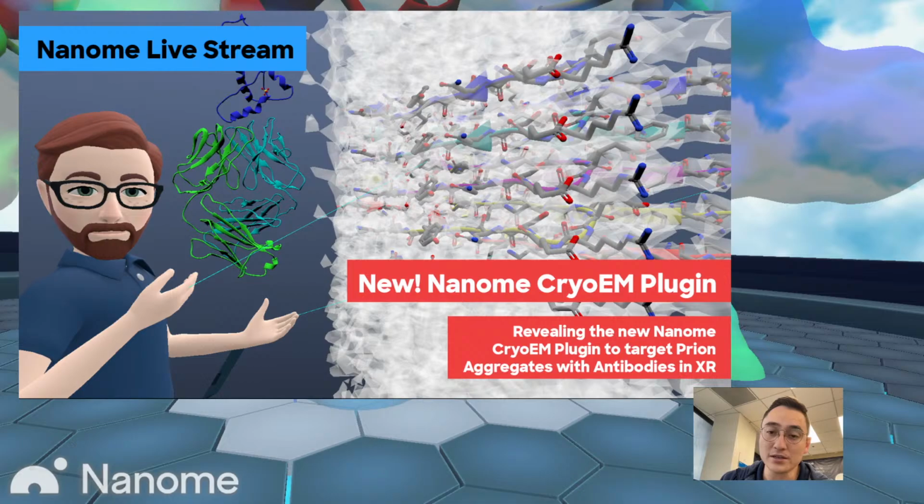Additionally, the plugin offers a range of customization options, such as adjusting color schemes and opacity of maps and using a viewport editor to show only certain portions of the map. We can't wait to showcase these features and demonstrate how they can benefit your research and analysis. So join us today to learn more about this game-changing tool and how it can revolutionize your work in the field of structural biology and drug discovery.